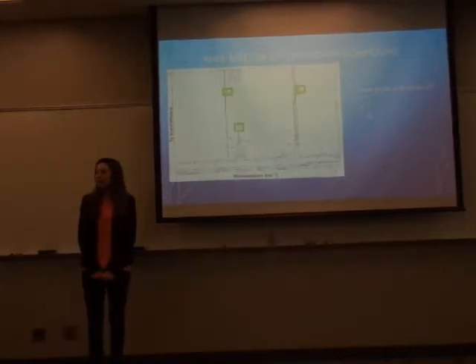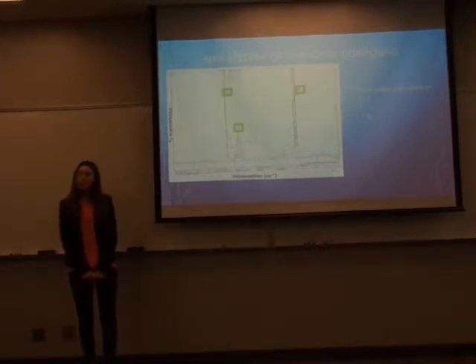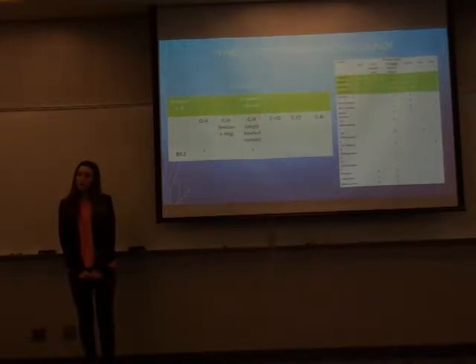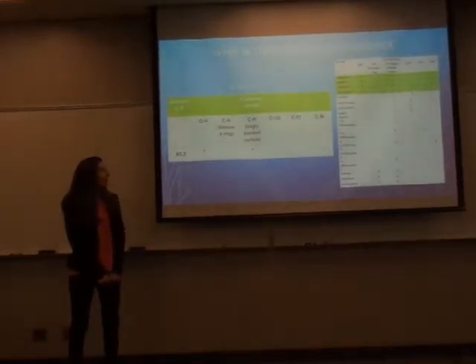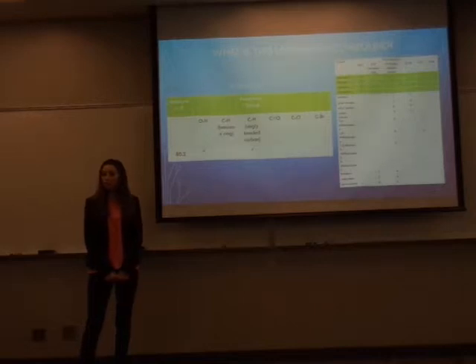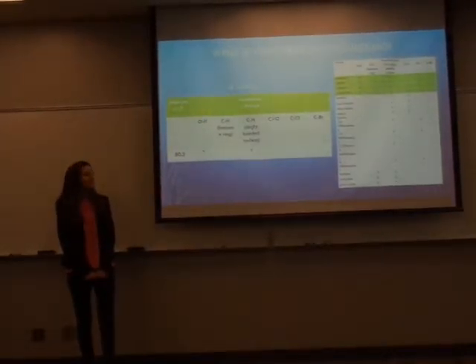Now that we have tested the unknown compound using IR and NMR, we are able to compare the results to the predicted IR and NMR tables developed at the beginning of the experiment. As you recall, the IR spectra showed that an OH and a C-H single-bonded functional group were present in the spectra.